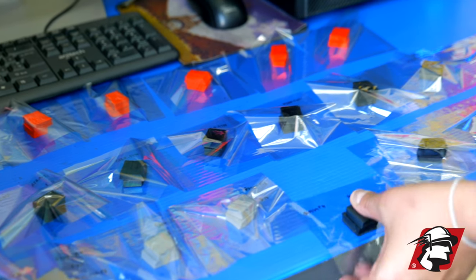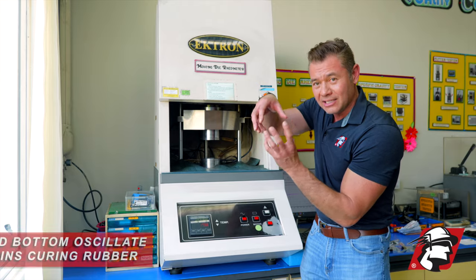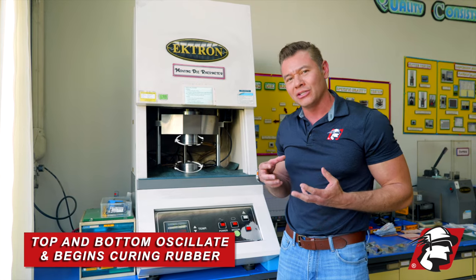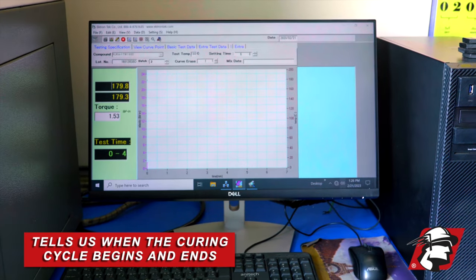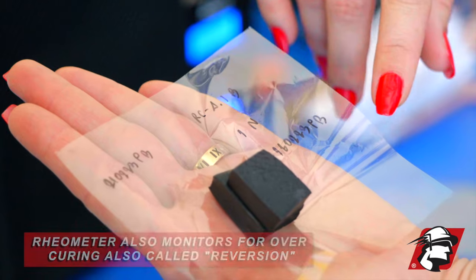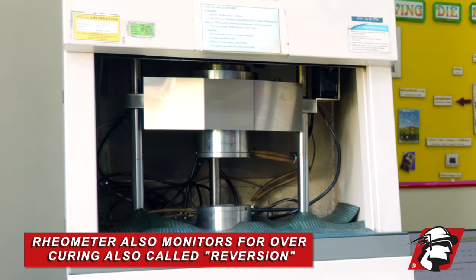We test every batch that we mix. What we do is take this rubber compound and stick it into this moving die rheometer — the top and bottom are oscillating. As the rubber begins to cure, the torque increases, and that tells us when the curing cycle begins and when it ends, and also if there's a chance of over-curing or what we call reversion.